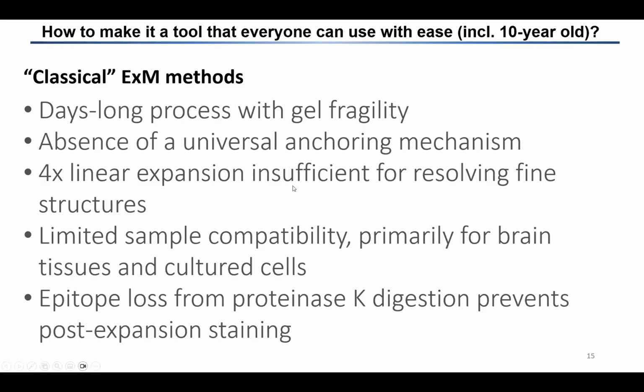And not to mention, the expansion factor is too small. So, only 4 times, that provides you roughly 70 nanometers resolution. That's okay, but not quite enough for many applications.